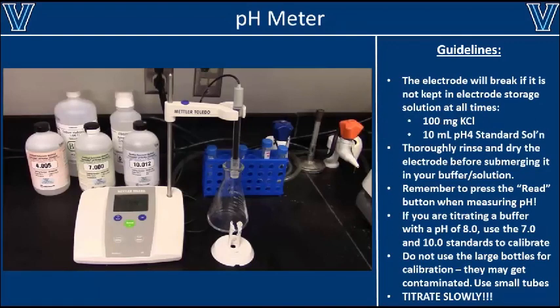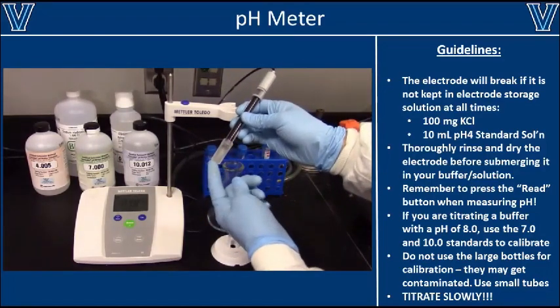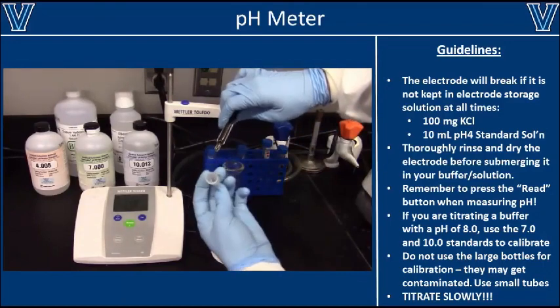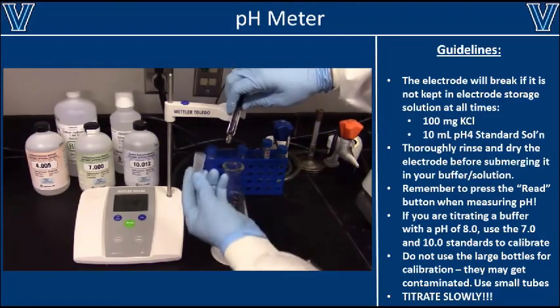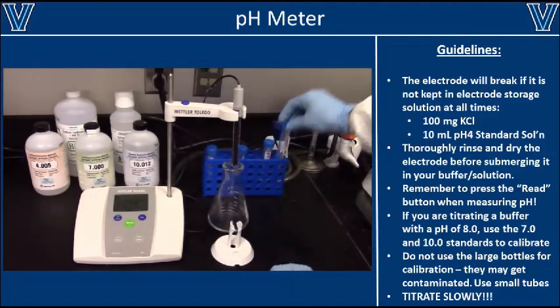The most important thing you need to know about a pH meter is that the electrode must be stored in electrode storage solution in between uses. If the electrode storage solution runs dry, then the pH meter will stop working properly and the electrode may even break. If you ever notice that the storage solution has run dry, immediately fill it back up with fresh electrode storage solution.